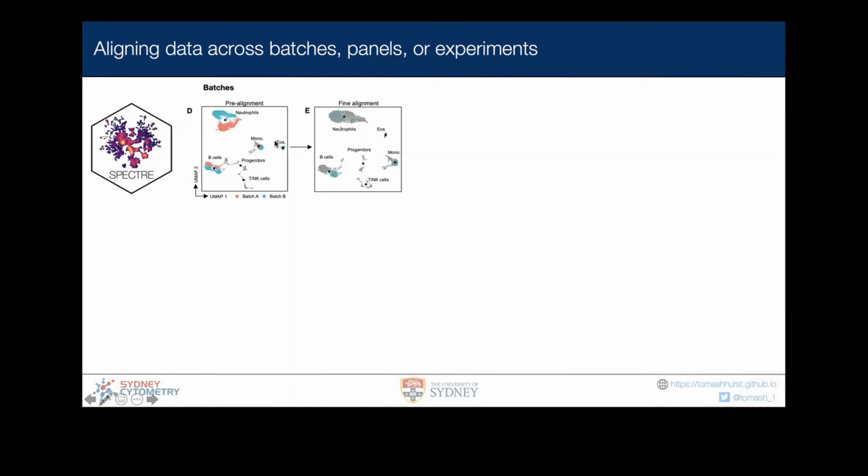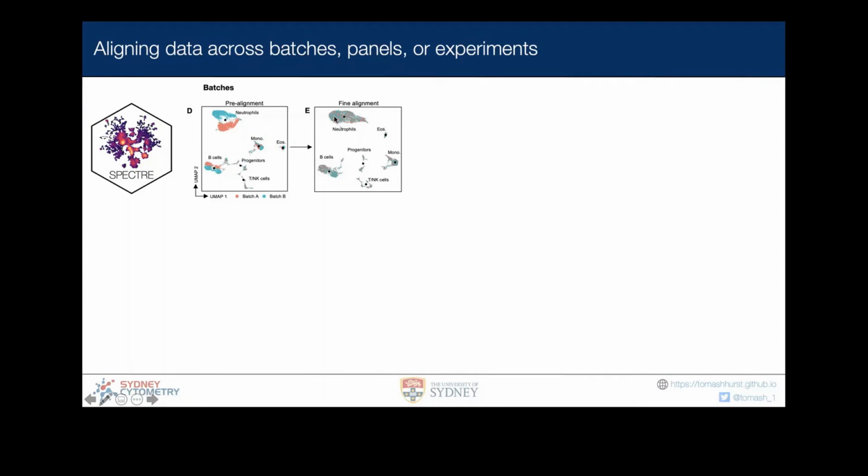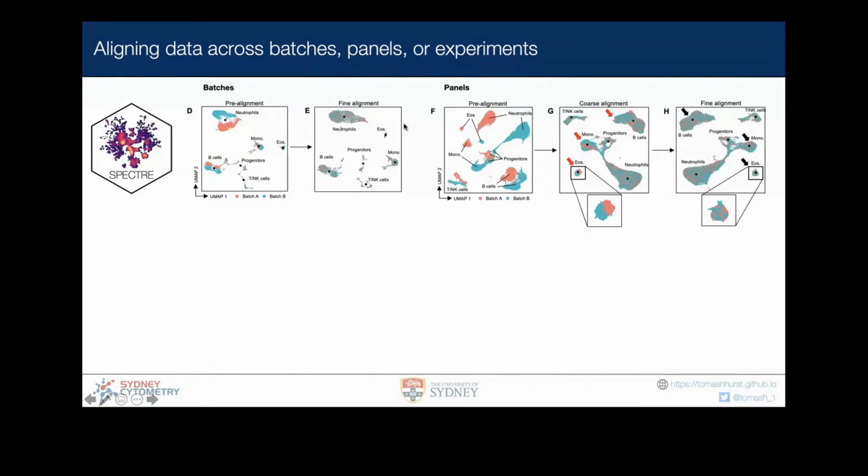So this is what it looks like. If we've got small batch effects, we can align the data reasonably well, and that all intermixes. If we have very significant batch effects, we may do this a little differently. We may do this through a couple of steps, but ultimately we can get the data to intermix. So the batches have become integrated. Any differences that we see between samples should be due to the experimental group, not the batch. Now, importantly, we've incorporated not just CytoNorm, but a few different approaches that have been published over the last few years.